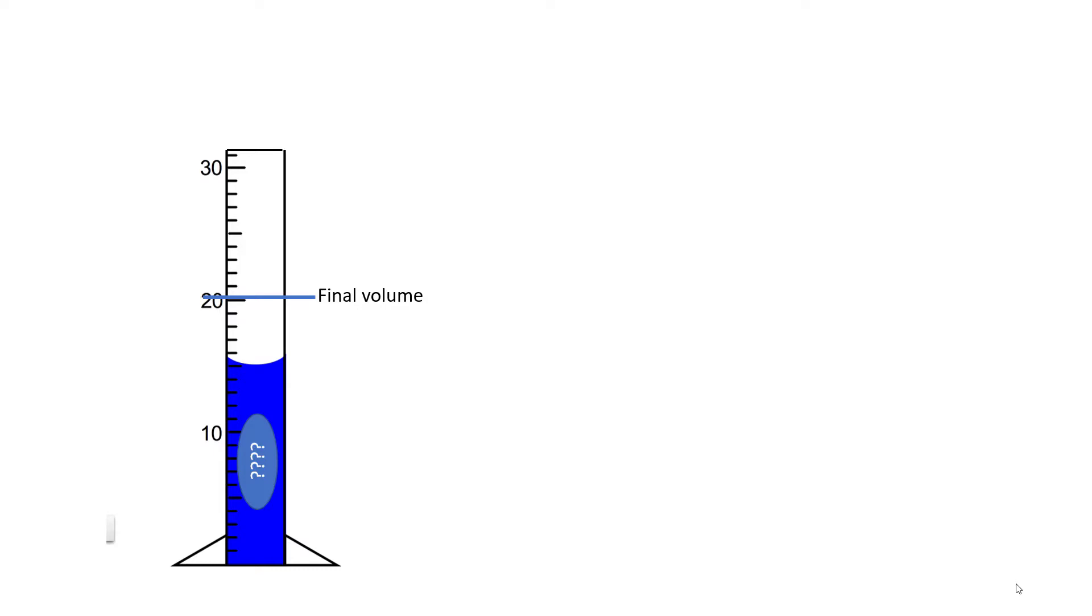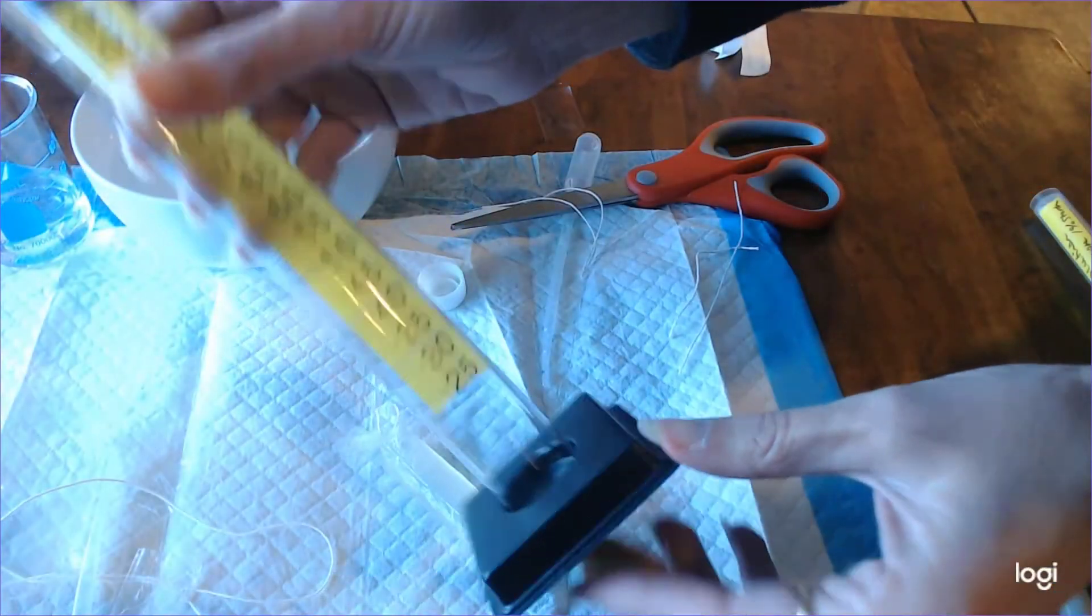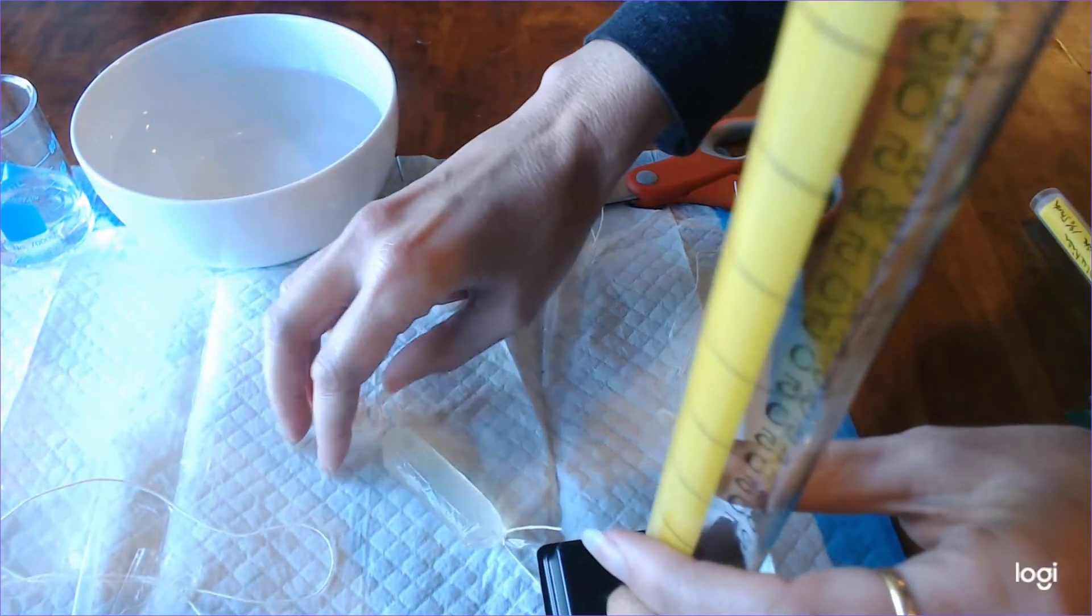We're going to use that same approach here to measure the volume of the dialysis bag.